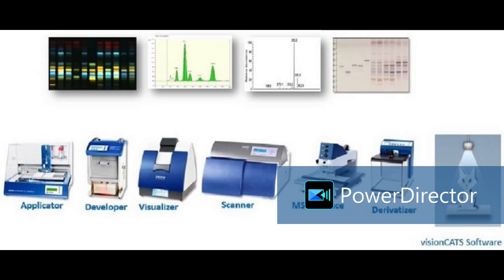So this is the standardized methodology. We always take a 20 by 10 centimeter plate. We apply an 8 mm band on the plate. We keep the distance between two bands the same and constant, and from one edge of the plate we apply at a particular distance: from the bottom of the plate at 8 mm, and from the corner 20 mm. This is as per USP, United States Pharmacopoeia guidelines for HPTLC analysis.